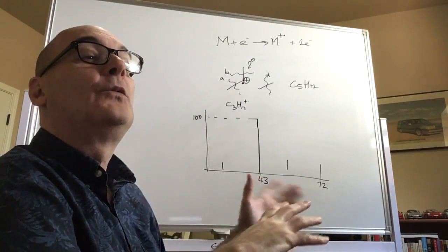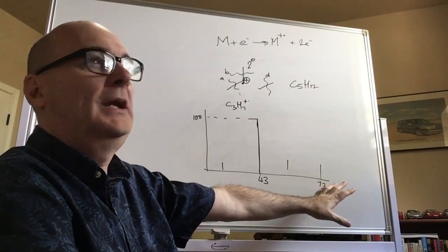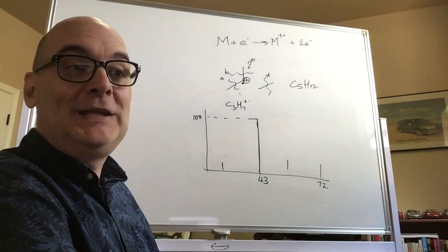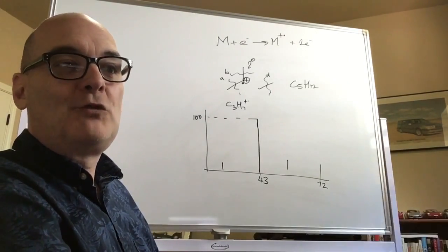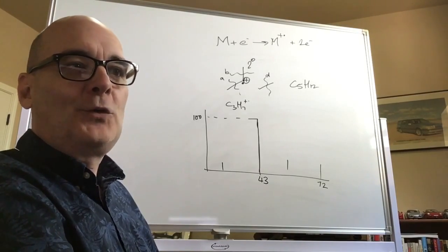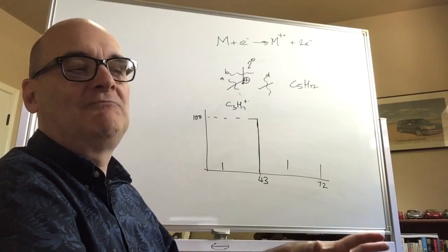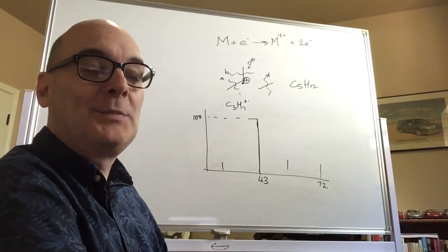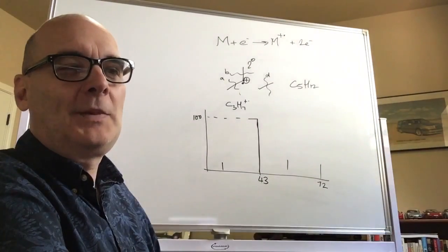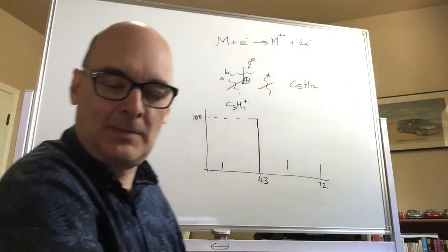And then look at what your molecular ion is, subtract as many numbers of 13 from it, and what the remaining number is, that's where all the interesting part of the molecule is, and you can construct the missing part from that. That's kind of a rule of thumb. I'm not sure that it's something that we're really going to have to follow.